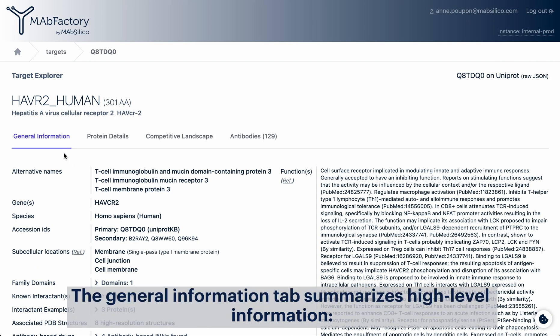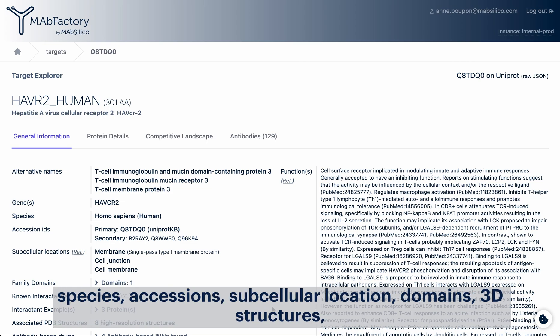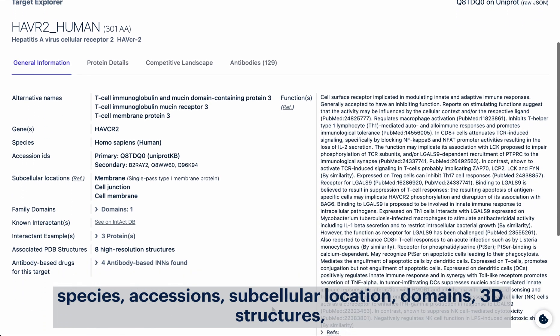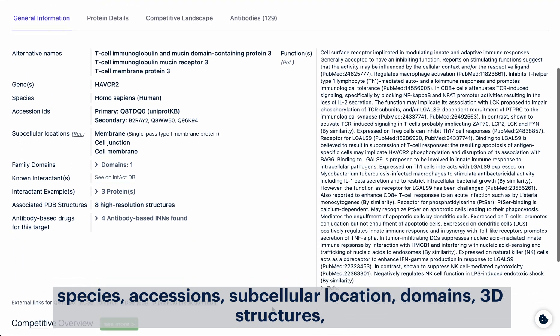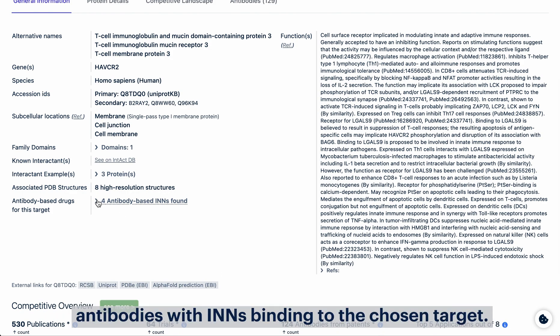The general information tab summarizes high-level information: species, accessions, subcellular locations, domains, 3D structures, and antibodies with INN binding to the chosen target.